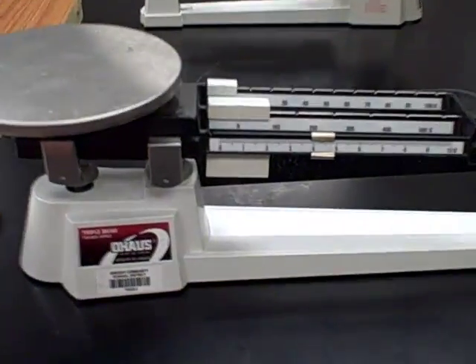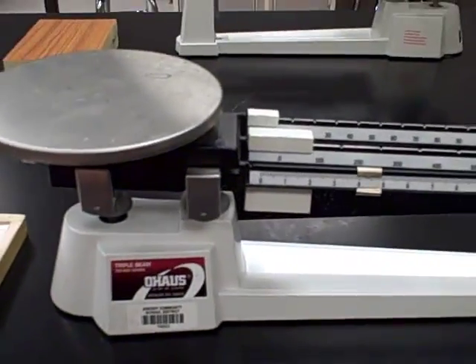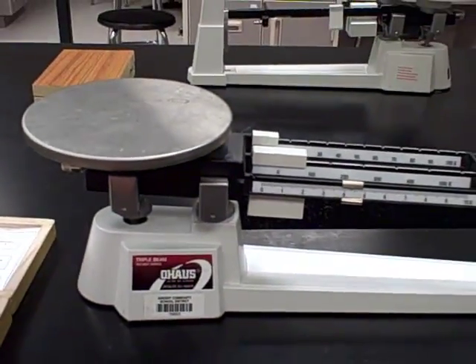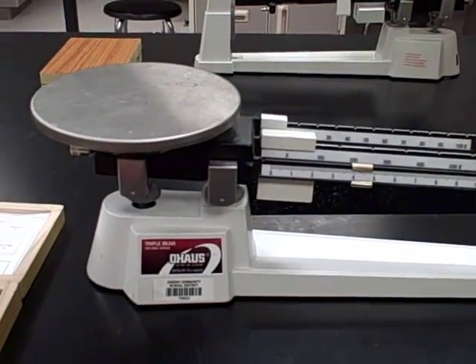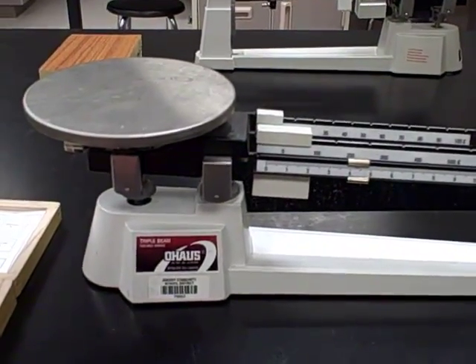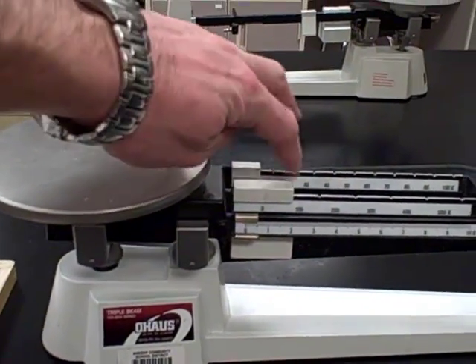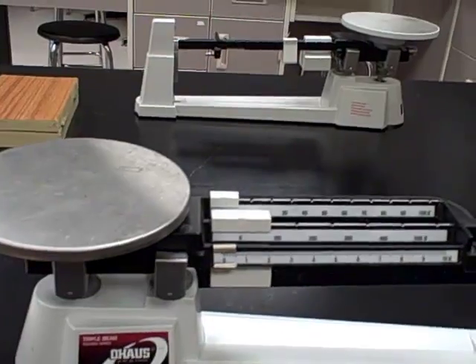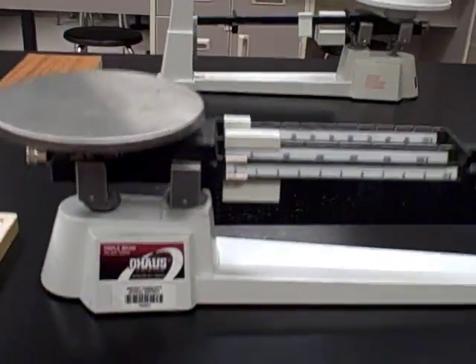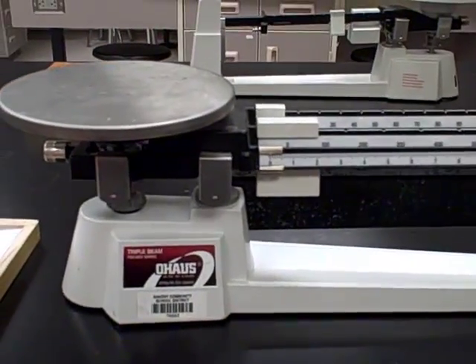First thing you need to do when you get to a balance is make sure it's calibrated. In order to calibrate it, first make sure all three riders are slid to the zero position, and then check over here to see if it's already calibrated. In this case, you can see the line on the left is not lined up with the zero mark on the right, so I have to do some calibration.